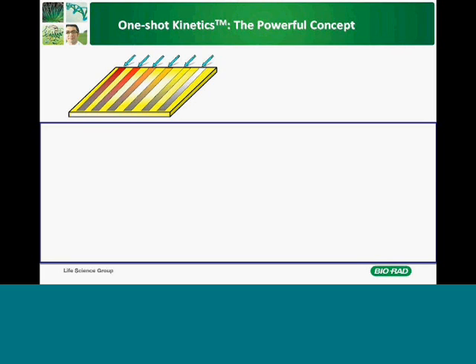But of course, you have the flexibility. You can immobilize today channel 1 and 2, and next week channel 3, 4, 5, and so on. And of course, you can immobilize different proteins, mutants, DNA. You have the freedom to use all the 6 channels the way you want.